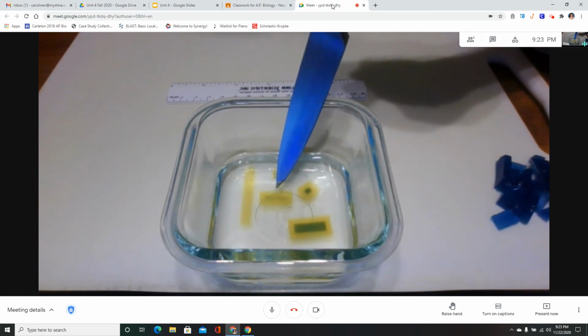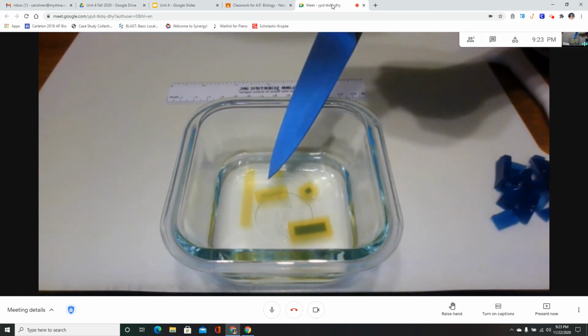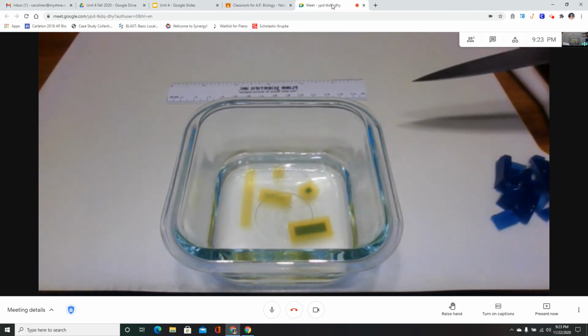Looks like the next one might be our smaller rectangle. There's still a strip of blue in the middle that's fading away, but that'll probably just be another minute or so.